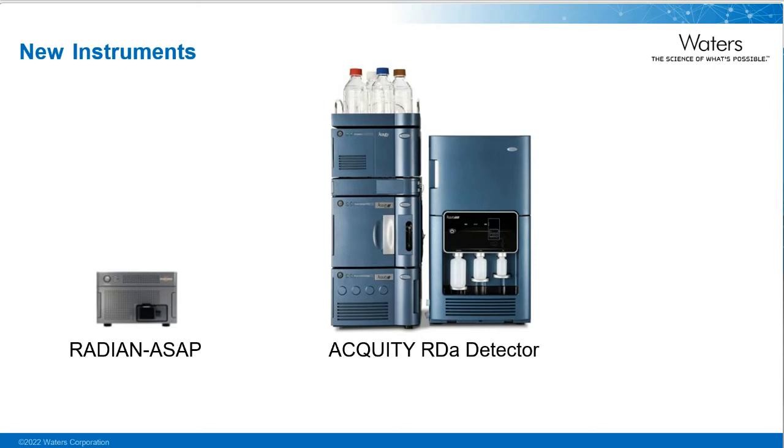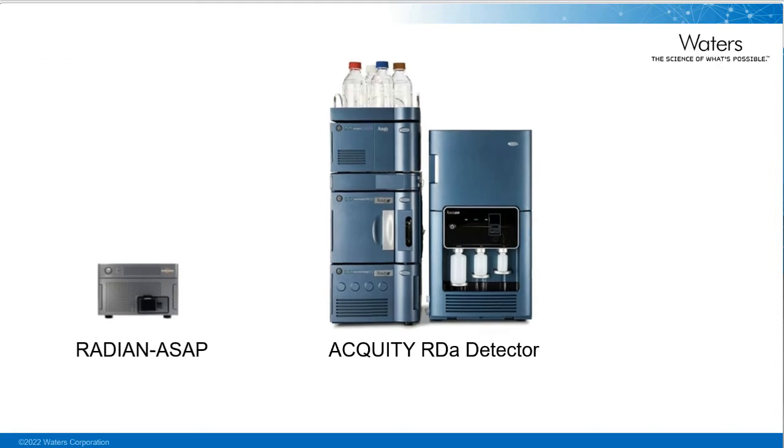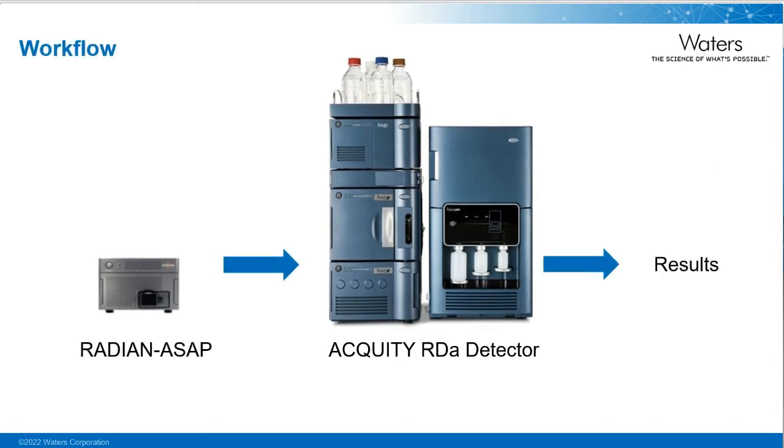However, myself and Nayan will be presenting an example workflow using both of these instruments in conjunction, with the RADIAN-ASAP being used as an initial screen, then confirmative analysis performed using the ACQUITY RDa.